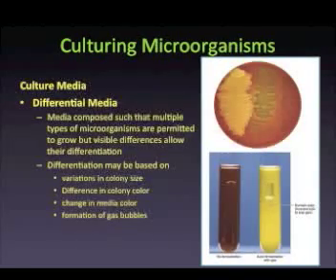Another example of differential media is observed in the bottom figure. In this case, the media is known as carbohydrate fermentation media. Carbohydrate fermentation tests are a differential test that determines the ability of an organism to ferment sugars. When organisms carry out fermentation of a carbohydrate, they may produce organic acids and/or gases as end products. Organisms utilize carbohydrates differently depending on the enzymes present within a given organism.